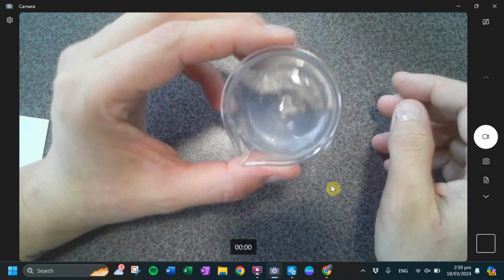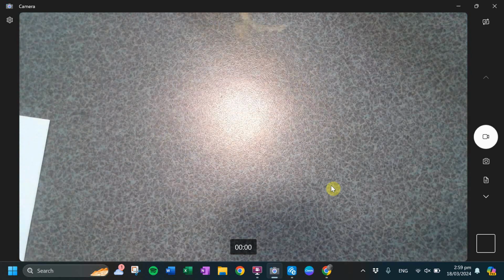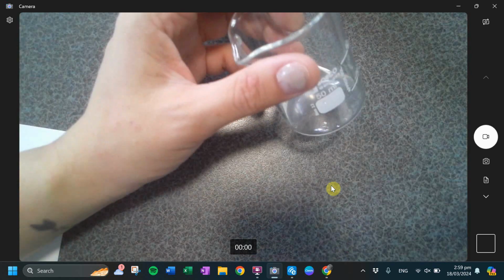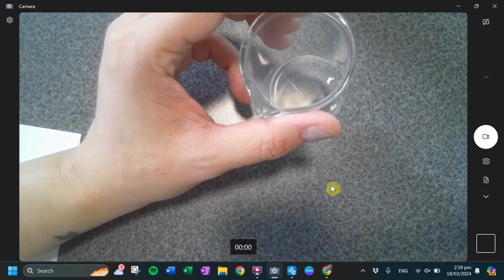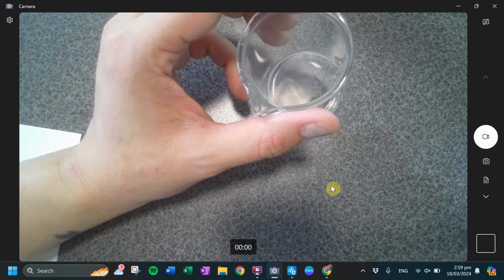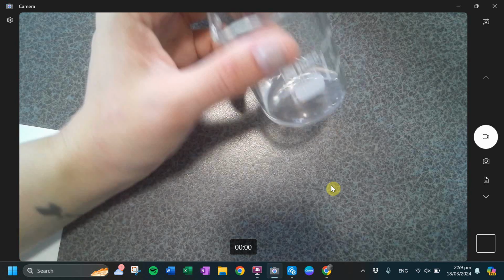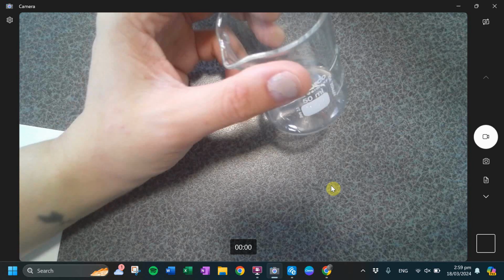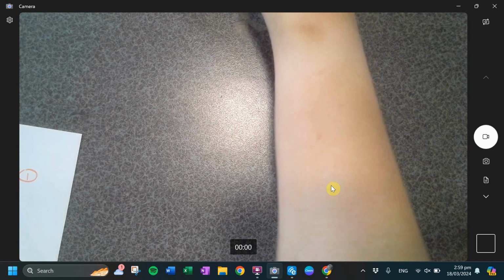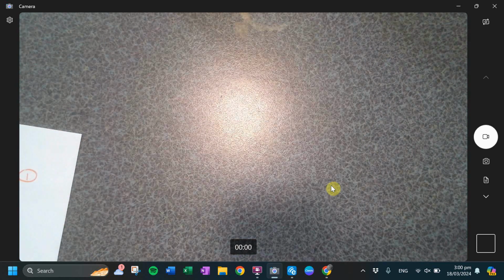What's in your beaker? Go do it. You should get something that's like a white jelly. You might need to squirt back and forth to try to get the balance right. It's a very temperamental assessment, this one. But you should get like some sort of whitish jelly. I did. I'll come over. Might need more ammonia. There we go. You might need to play with the ratios a bit, because it is a very temperamental assessment.